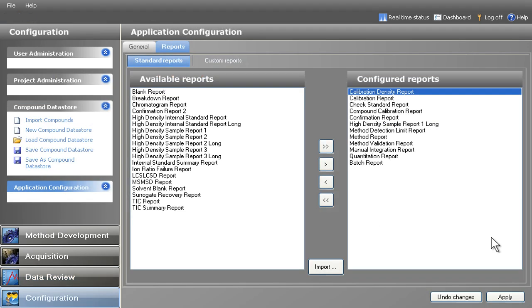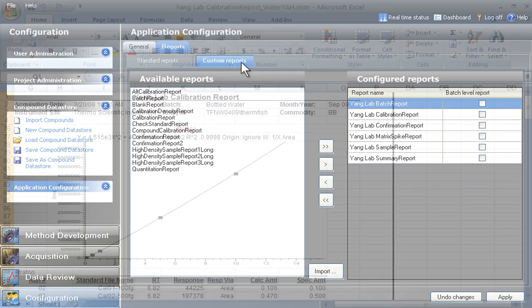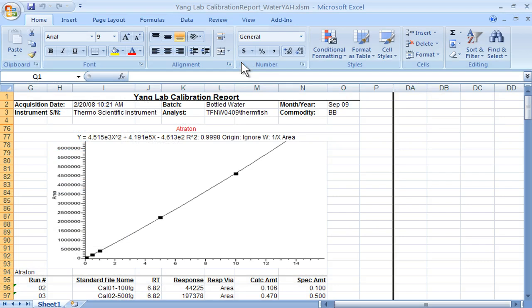Out of the box, TraceFinder provides an array of predefined reporting templates, as well as the ability to create custom reports tailored specifically to your needs in both Crystal Reports and Excel formats.